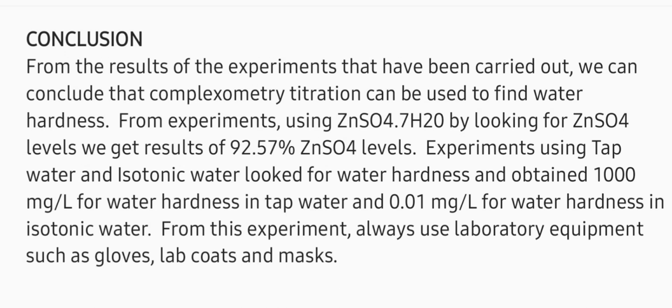And then, from these experiments, don't forget to always use laboratory equipment such as gloves, lab coats, and masks.